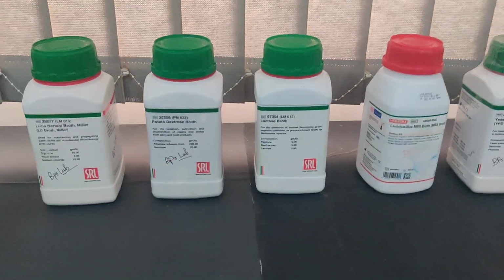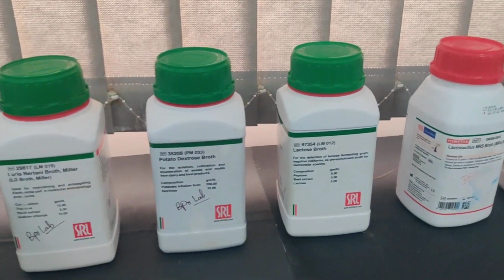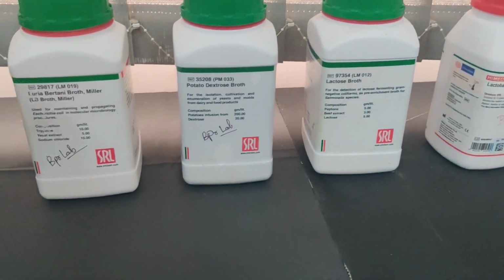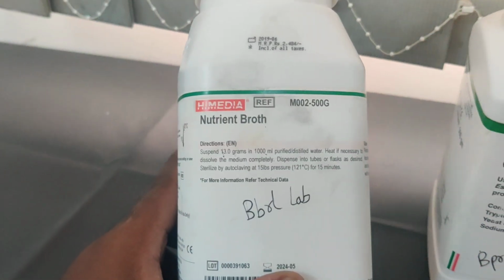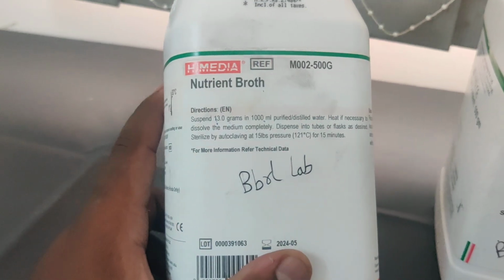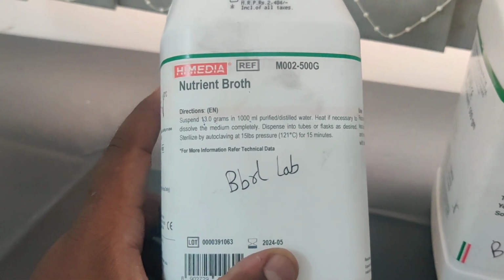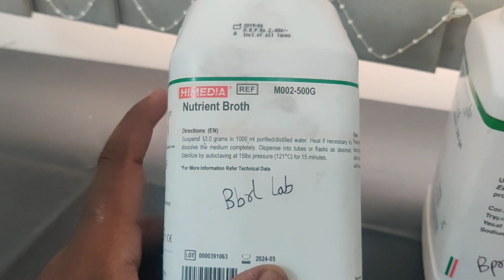Okay. So how do I weigh this, how much I have to take and how much I have to dissolve in distilled water, everything is very important. And the complete procedures they would have given on the bottle itself. So if you see, suspend 13 grams of this particular nutrient broth in 1000 ml purified or distilled water, and then you can autoclave it.